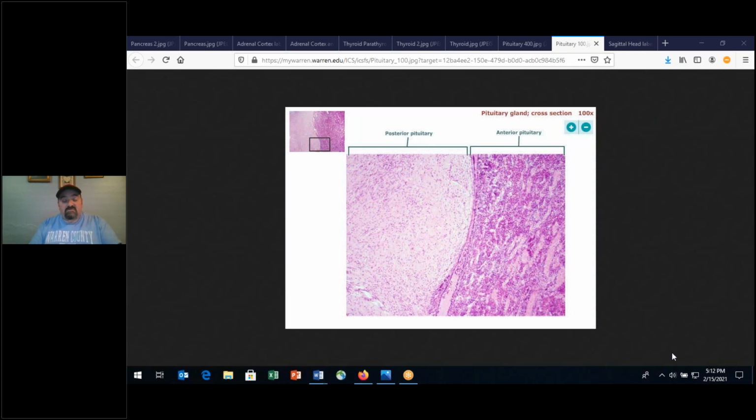So tonight we're going to start off with looking at endocrine histology. In the lecture on Wednesday, we will be finishing up and reviewing the autonomic nervous system. The chapter right after that will be the endocrine system, and there'll be quite a bit of information that we'll be covering regarding that system. So here in the lab, we're going to be looking at the histology and the different slides that you will have to identify as far as the specific types of tissues.